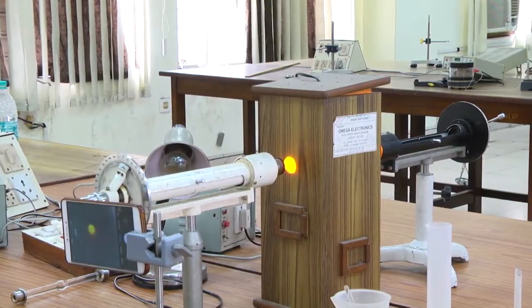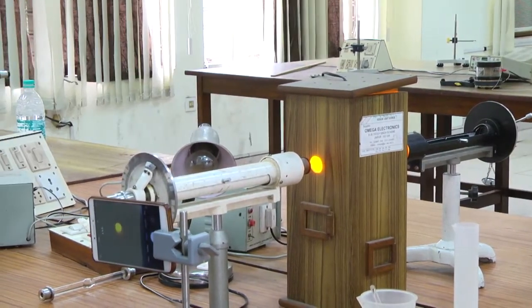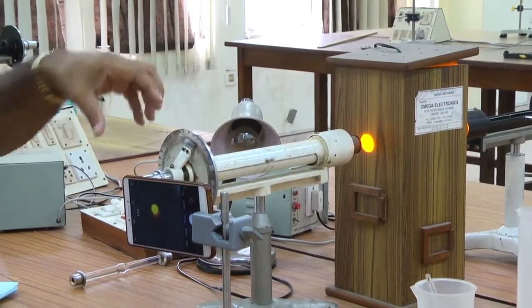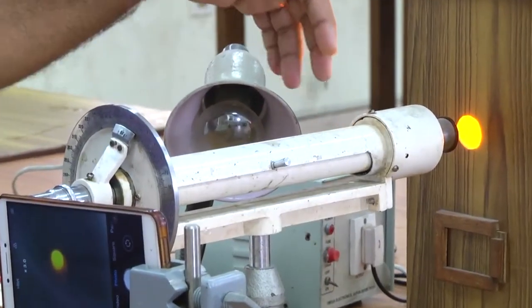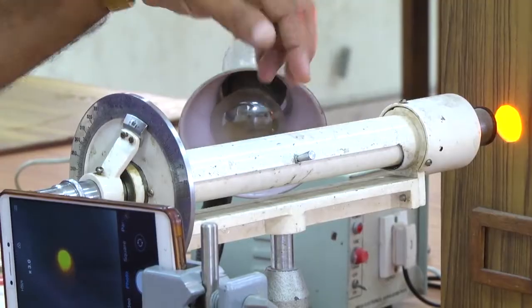So, this is the polarimeter. In polarimeter, what things are there I explained. You have collimator, you have telescope, in between you have polarizer and then half shade. That is inside, you cannot see.